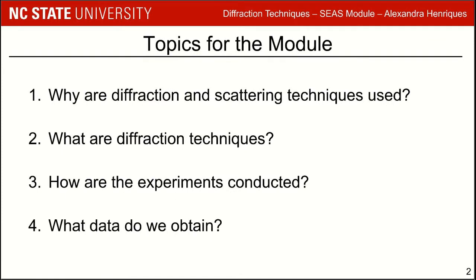In today's module, we'll be trying to answer four main questions. 1. Why are diffraction and scattering techniques used? 2. What are diffraction techniques? 3. How are the experiments conducted? And 4. What data do we obtain?